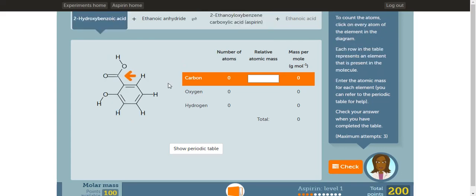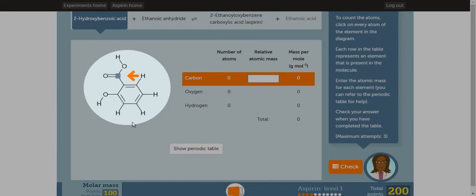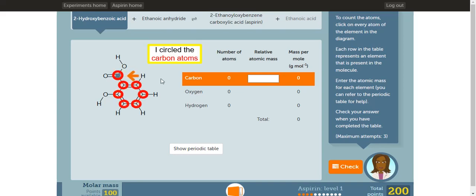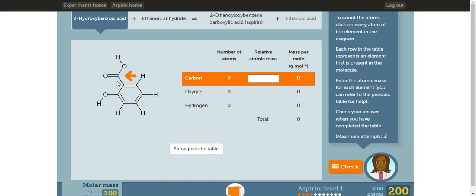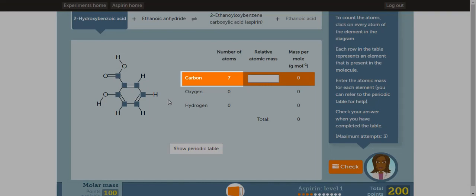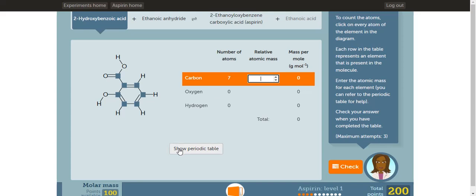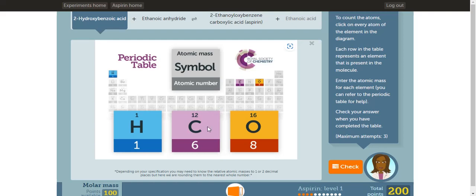I'm going to do one substance as an example. This diagram represents a line diagram which is used in organic chemistry to draw a shorthand notation of the structural formula. In the first part of this activity, you must first count the number of carbon atoms. In the line diagram, carbon atoms are not shown, since line diagram is a shorthand notation. The carbon atoms are located at the juncture where the bonds meet. Now click and select all the carbon atoms. There is a total of 7 carbon atoms in this molecule. Next, you want to enter the relative atomic mass. If you forgot the atomic mass of carbon, you can click show periodic table to look up the atomic mass of carbon, which is 12.